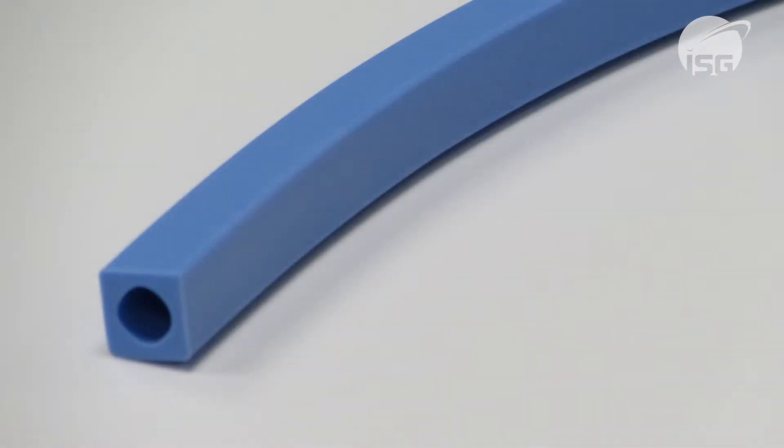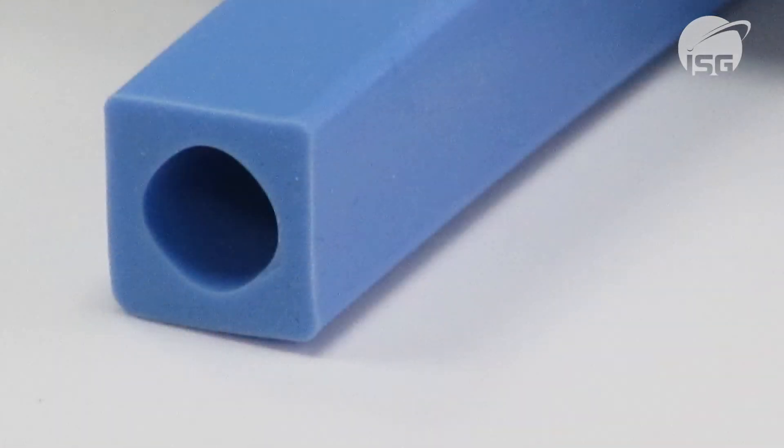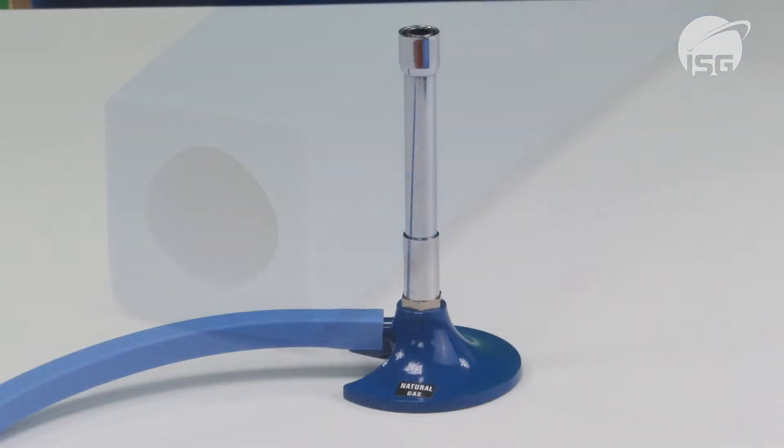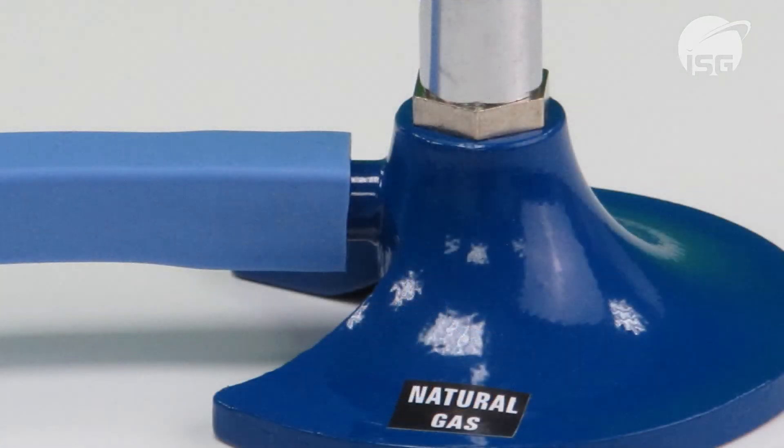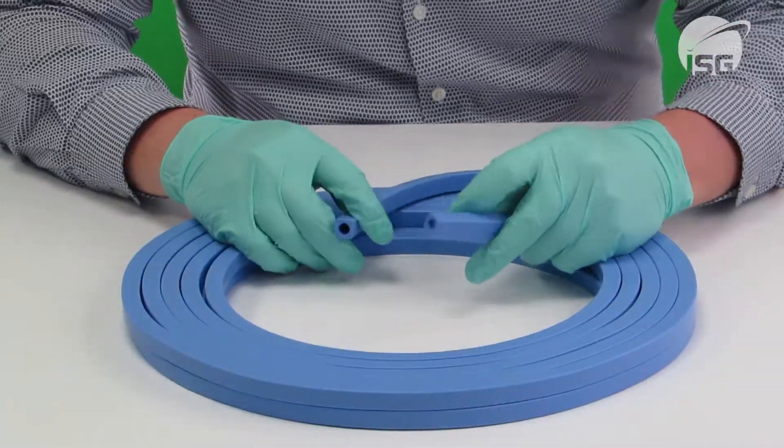The ISG Enduroflex tubing is an innovative square form tubing designed for general laboratory use. This tubing is made from a polymer blend which is designed to replace natural rubber and is guaranteed to last 10 times longer. The tubing will not perish and is resistant to UV rays.